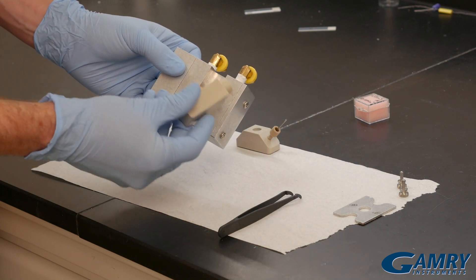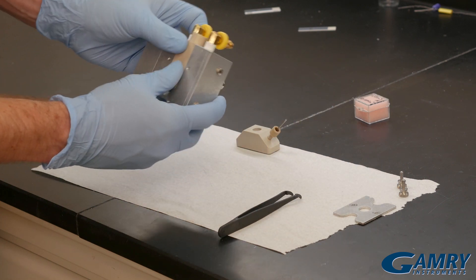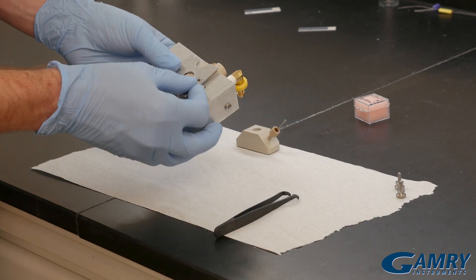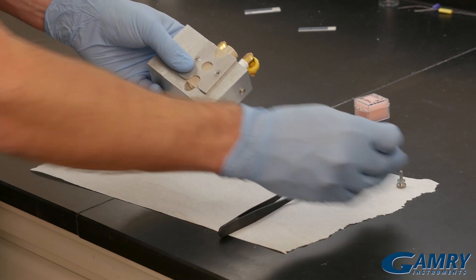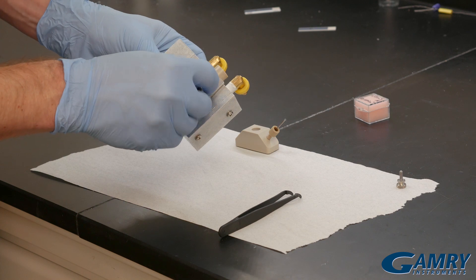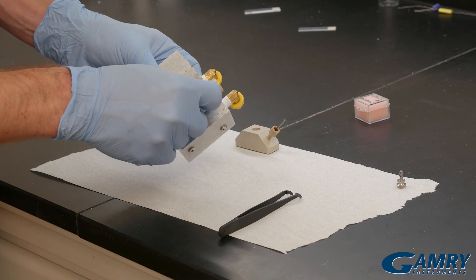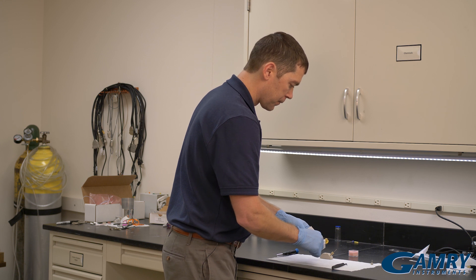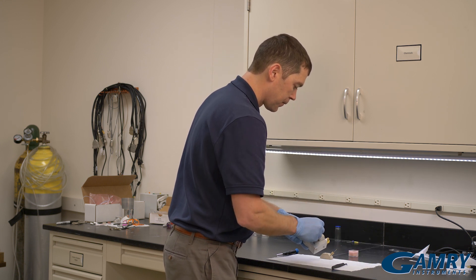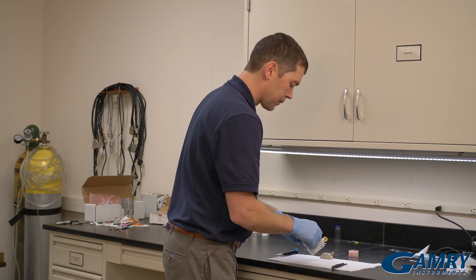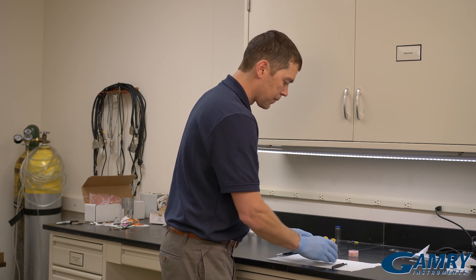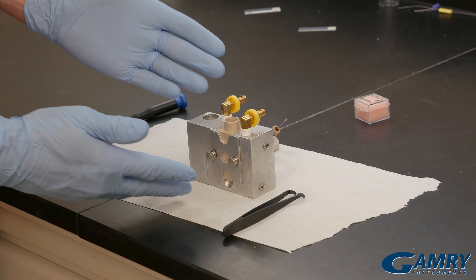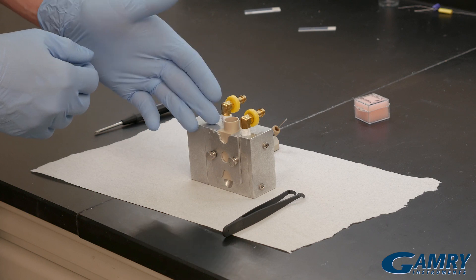So next I can put my static cell on, put the capture plate over top, and use my two thumbscrews to secure it. And there we would have our QCM cell used in a static configuration.